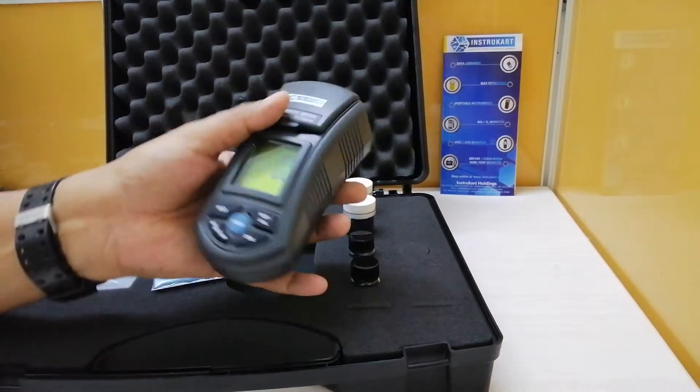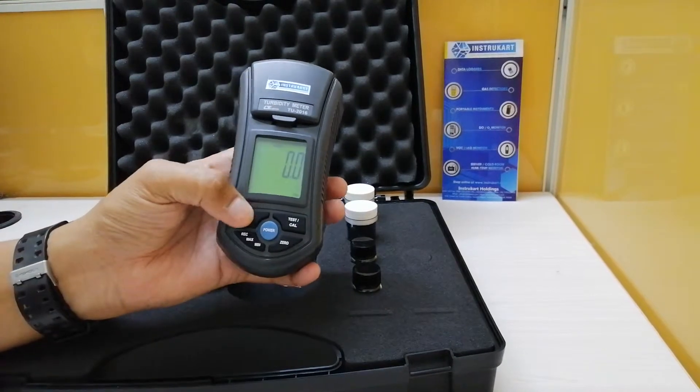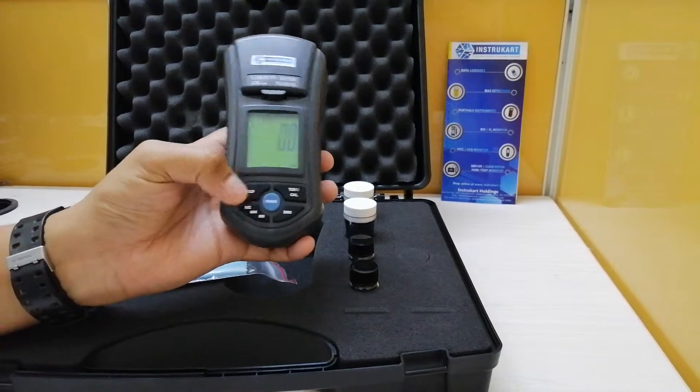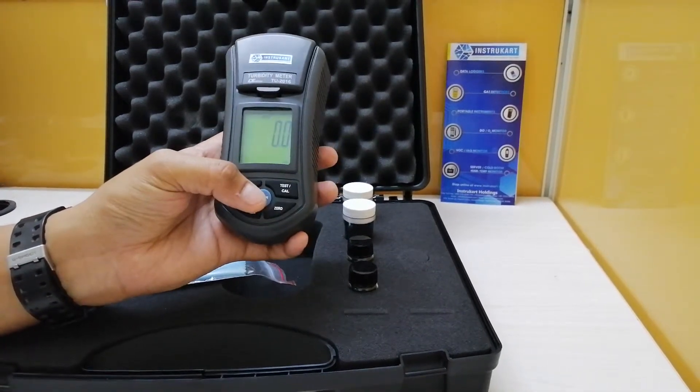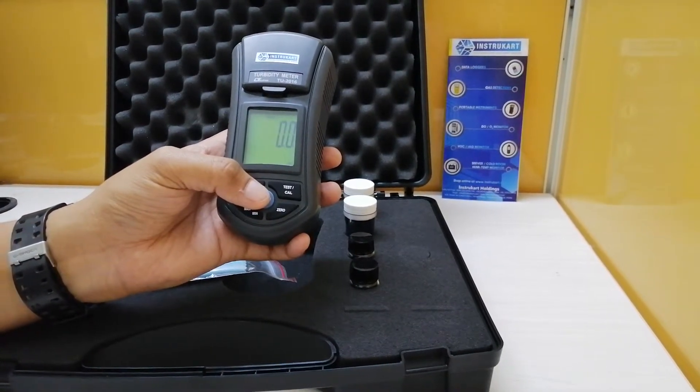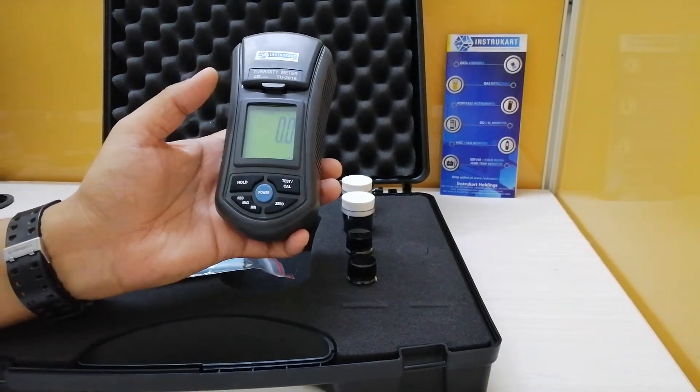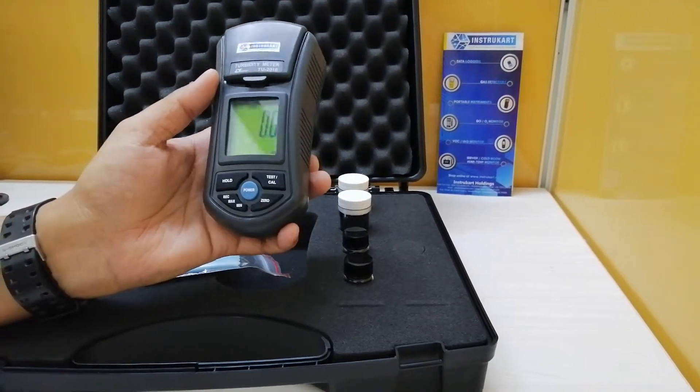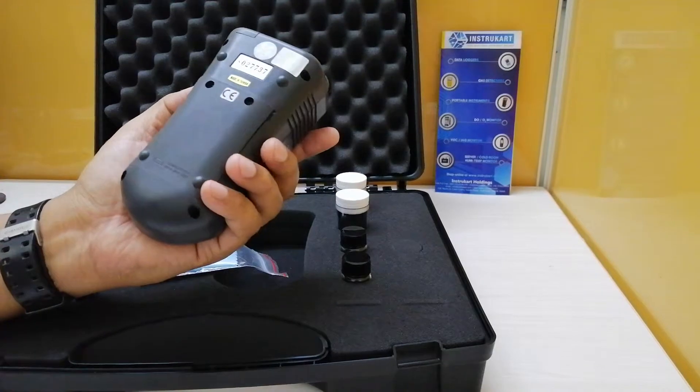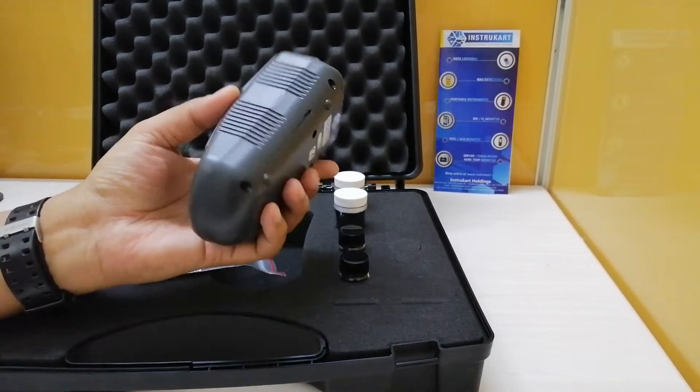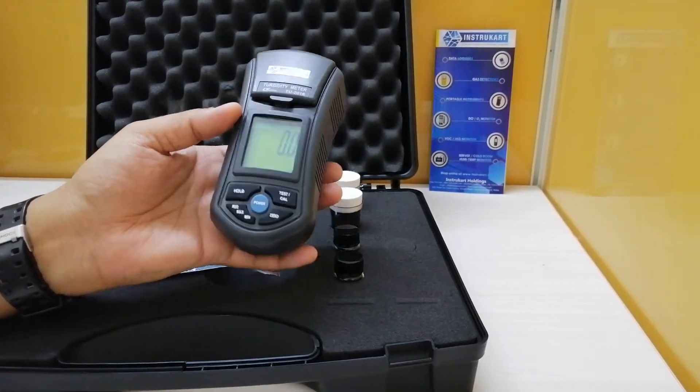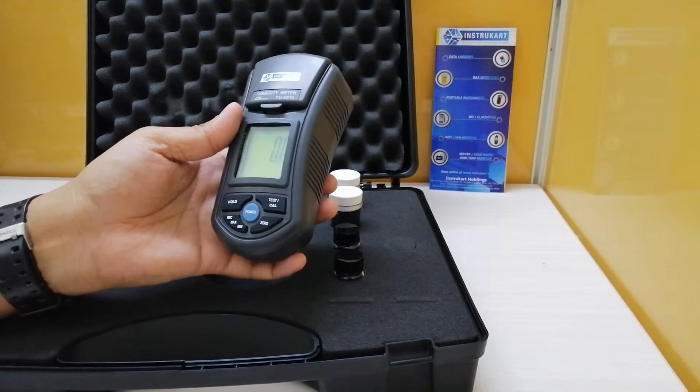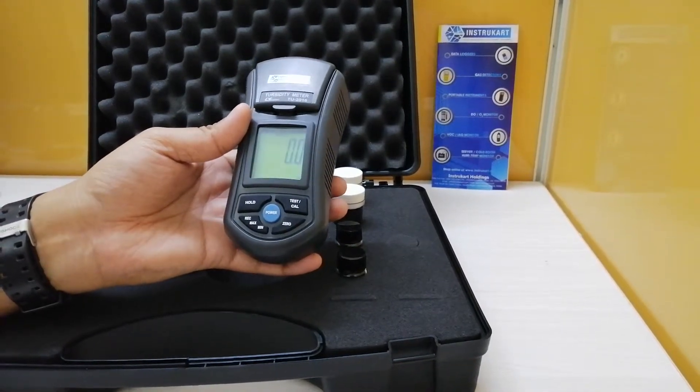Now the LCD is a very jumbo LCD and it has got an easy readout. It has got some keys on the front: hold key, test calibration, record, minimum, maximum, zero and power. And it has also got a resolution of the ISO 7027 compliant, which means that it is very well suited for testing in applications where you want to check the contamination of water with any suspended particles.